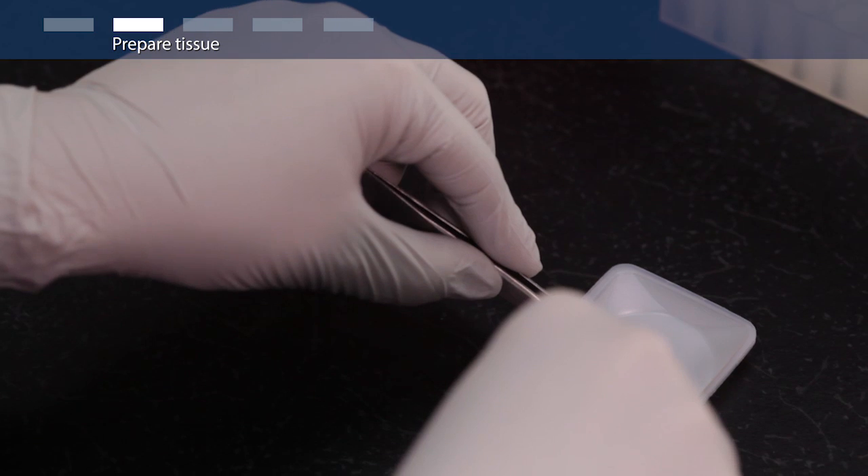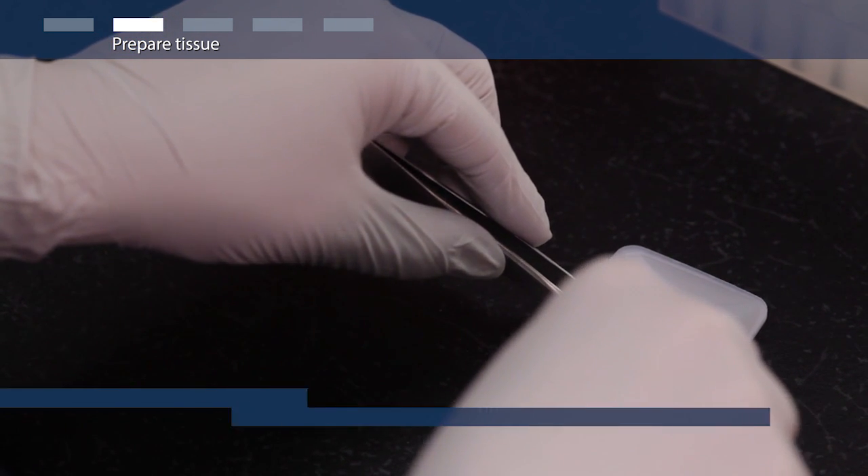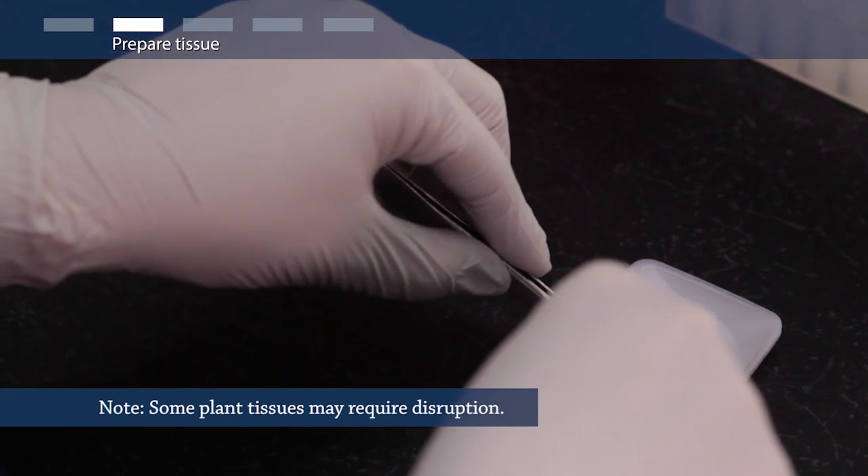If you are working with large tissue, cut the tissue in pieces about half a centimeter in size. Whole small organs like mouse liver, kidney, and spleen are fine.